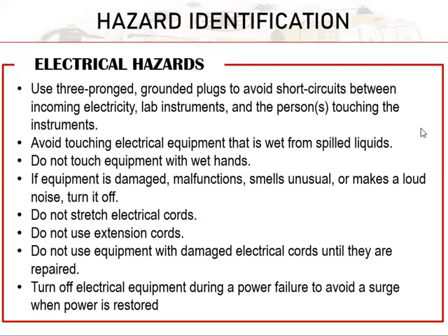And then do not use extension cords. Our machines are very big. They are much bigger than your refrigerators at home. So extension wires are not ideal, because the machines require higher voltage. It should be plugged directly into a wall-mounted outlet.